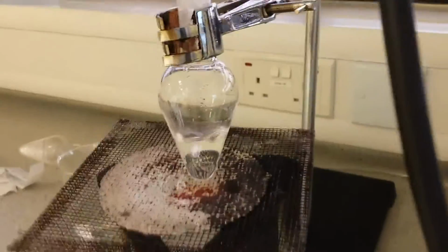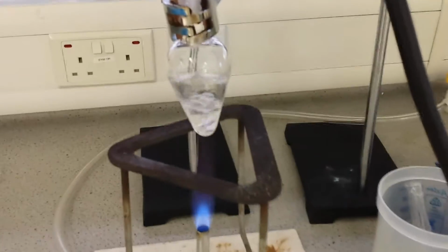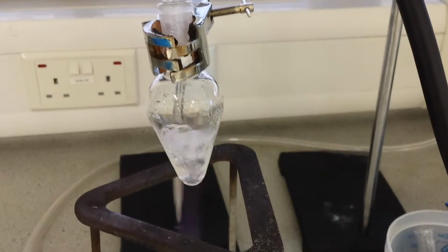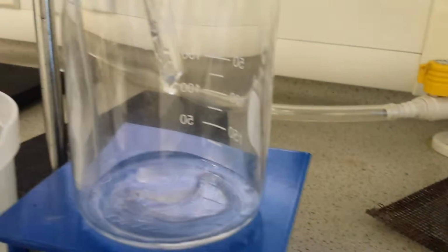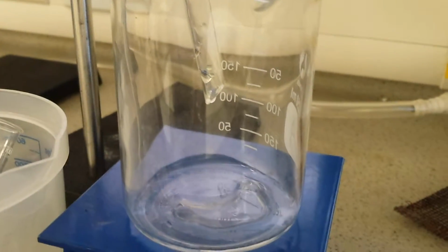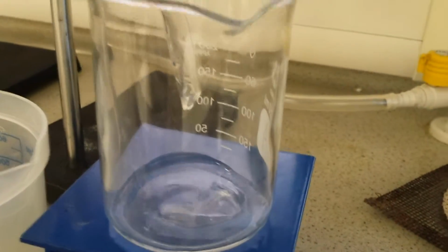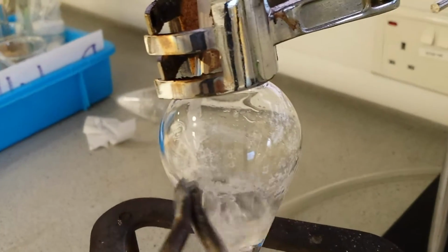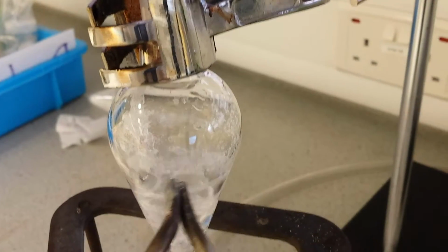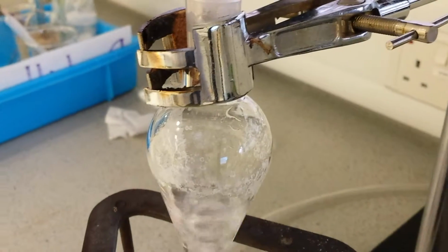There's some water already. So we'll come back later on. As you can see, it's starting to boil. We'll continue later. As you can see, the water is boiling rapidly, and you can see that the steam is turning into liquid, and it's already dropping into the other beaker on the other side. And at the same time, if you can see, there are white substances attached to the top of the flask. What do you think that is?